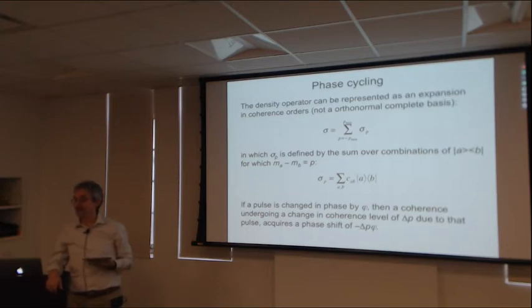And that means if you look at your triple resonance pulse sequences or an HSQC, the phase shifts are almost always just X and minus X. And a 180-degree phase shift is easy to understand, why the receiver has to change from X to minus X, because the sign of the magnetization obviously is being inverted.